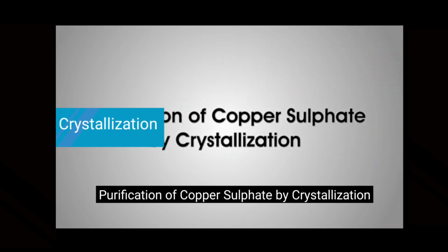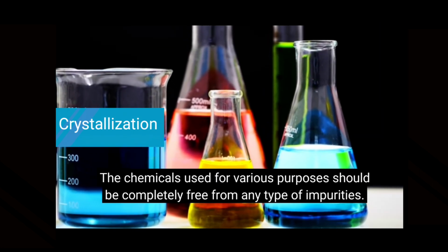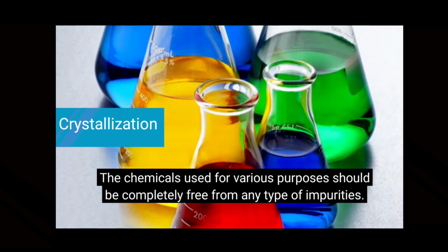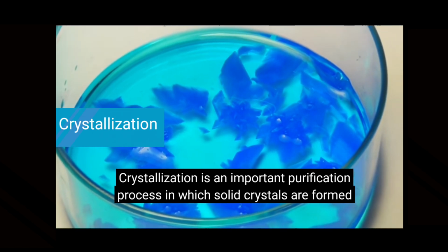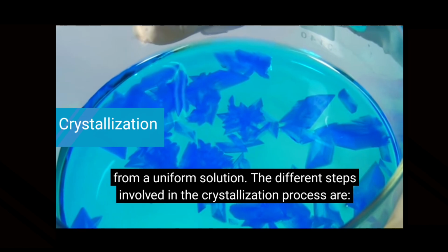Purification of copper sulphate by crystallization. The chemicals used for various purposes should be completely free from any type of impurities. Crystallization is an important purification process in which solid crystals are formed from a uniform solution.